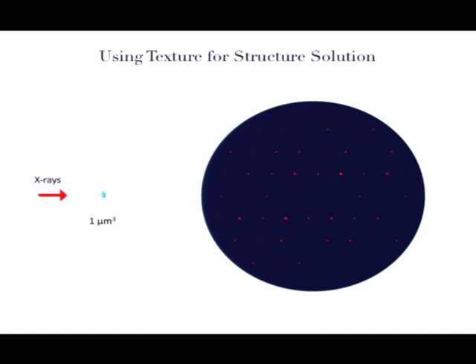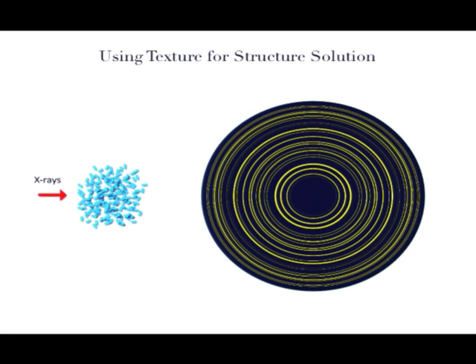So you have seen that if you have a small single crystal, you get an X-ray diffraction pattern, and if you have one with a second orientation, of course, you get the second orientation of the reciprocal lattice. If you have many crystals, you get these rings, which we are used to. And if you overlay the single crystal patterns, you have the well-known overlap problems. These four reflections all are under the same ring. And it doesn't matter in which direction or in which orientation I have the sample, I will always get the same result.